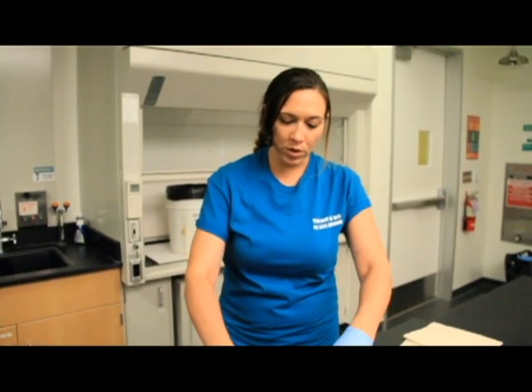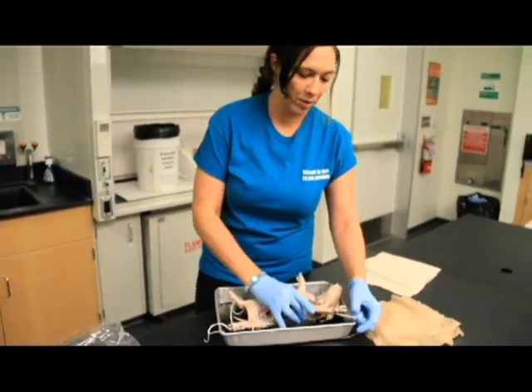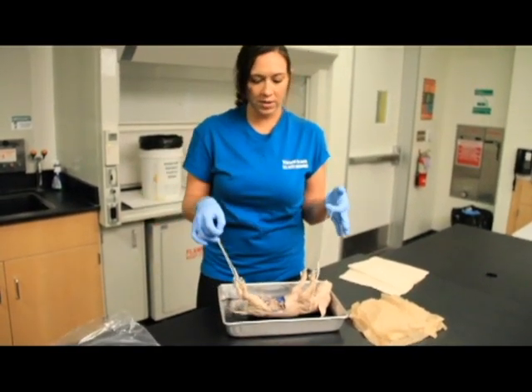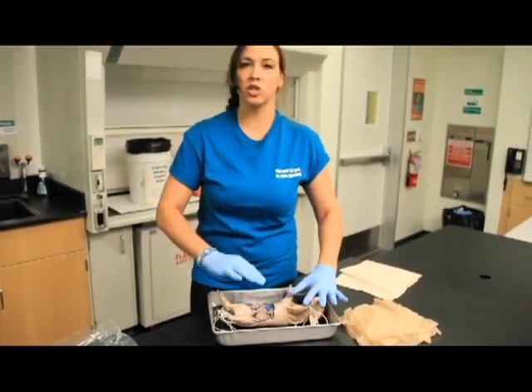Now we're ready for the cleanup. So the first thing you want to do is take these strings and slide them off from around the tray. You don't want to untie them because it'll be much easier next week if you already have them tied. So we just loosen them up so that we've basically just got a pig on a string.